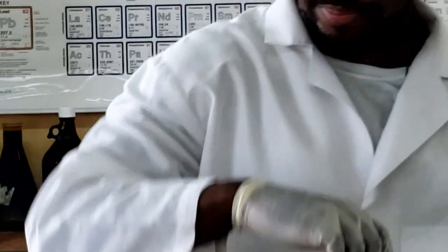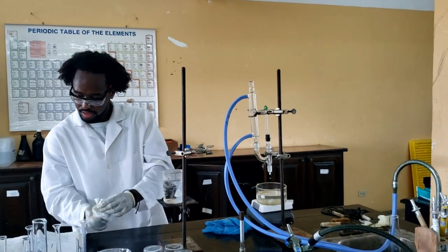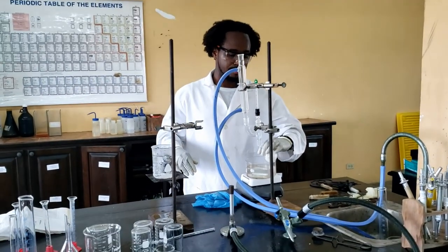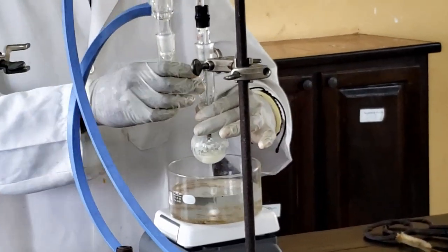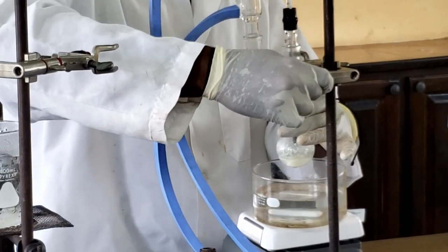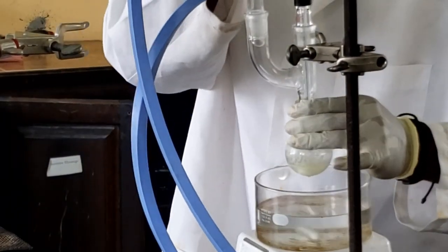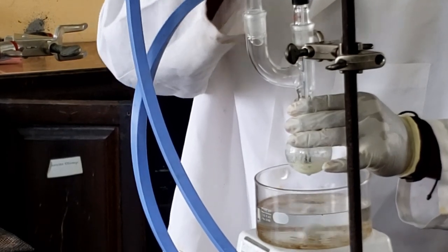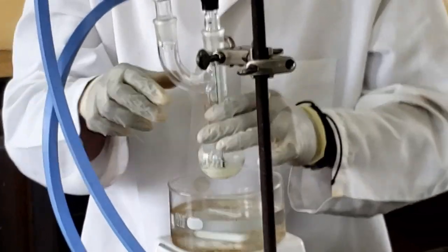What we now do is connect it to this apparatus, and we're going to warm this up to a bit below 60 degrees Celsius. We want to keep it at that temperature for about 60 minutes. This time we want to make sure the bulb of the thermometer is touching the reaction mixture, as that is the temperature we want. We want the temperature of that reaction mixture maintained below 60 degrees Celsius.